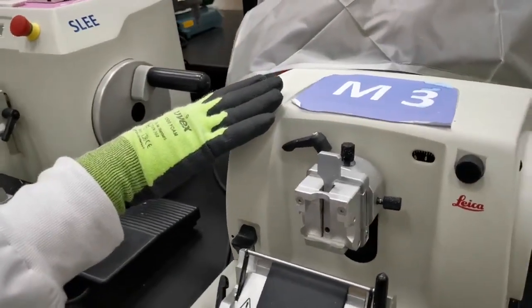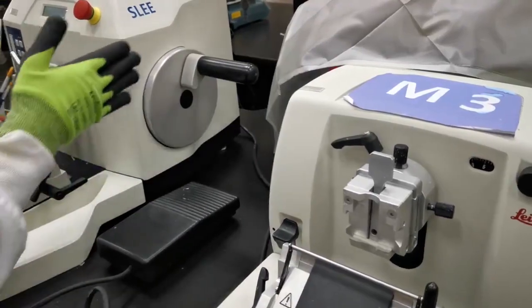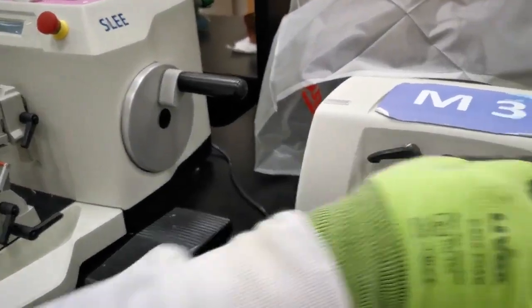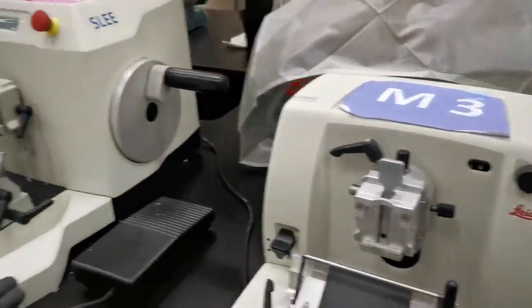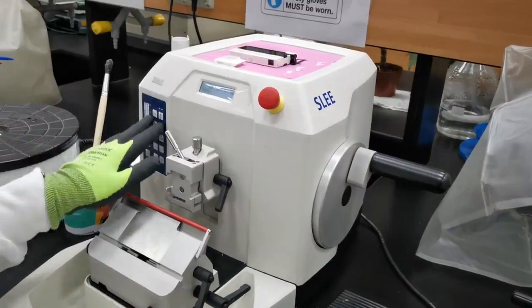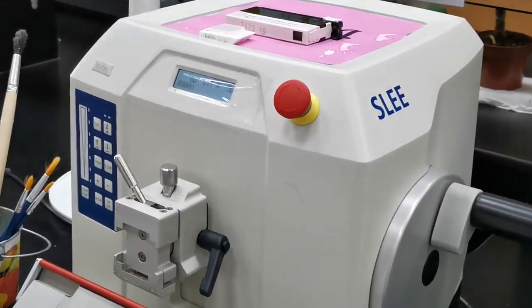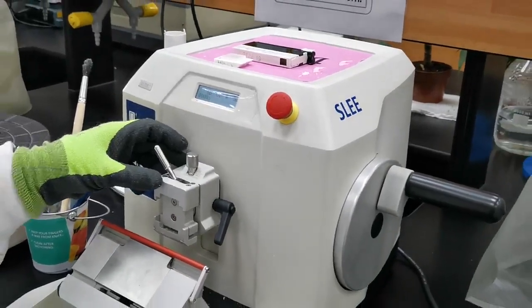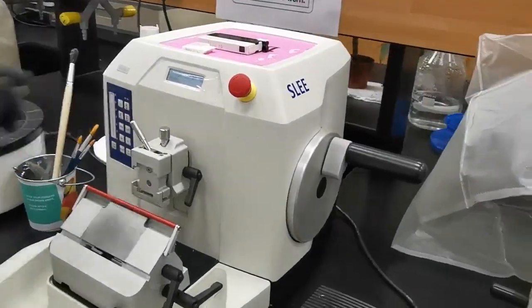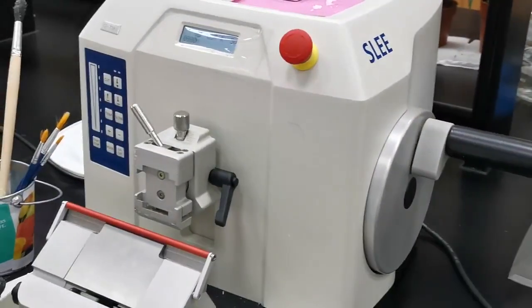Because people like automation and want to make life easier for technicians, they created this automated setup. Instead of controlling the thickness through knobs, there is an electronic board with buttons that control the cutting thickness and the movement of the block holder, and also the speed. This is the main difference between the manual rotary microtome and the automated one.